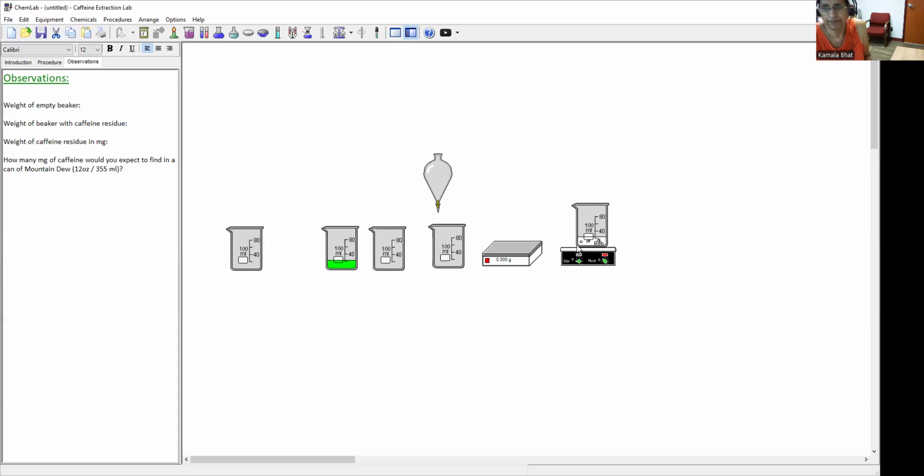So wait, once you get it, I don't think there is anything else to show you, because all you have to do is heat it, vaporize the alcohol out, and then complete it. Once the whole experiment is done, make sure that for each step you have your pictures in there so that you know what you have added and how much, and so you don't make a mistake.